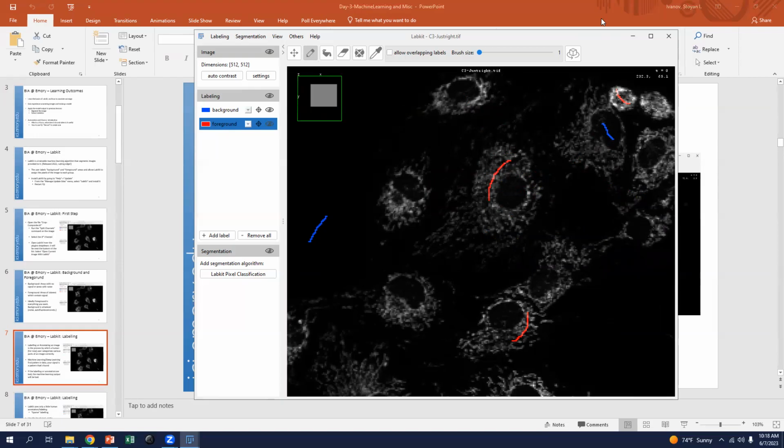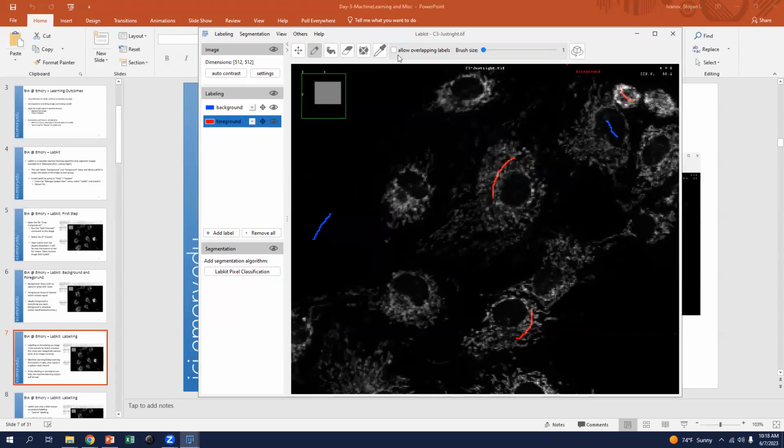So right now we're just operating on channel 3. Has everyone gotten to this point? Anyone having trouble?